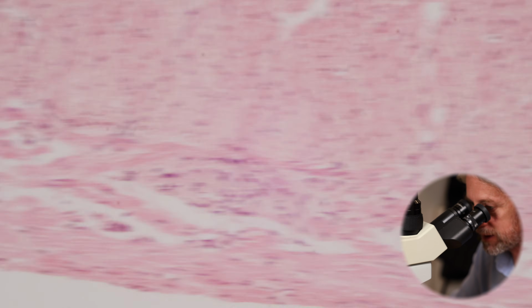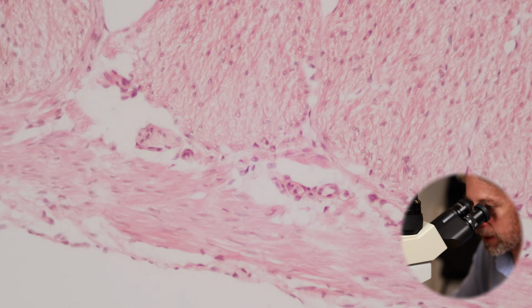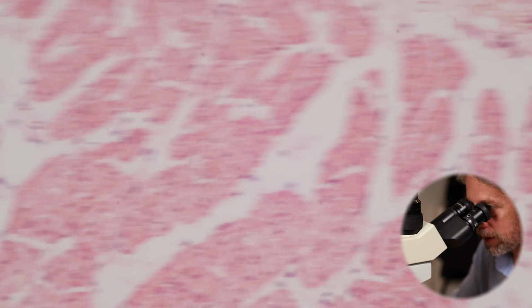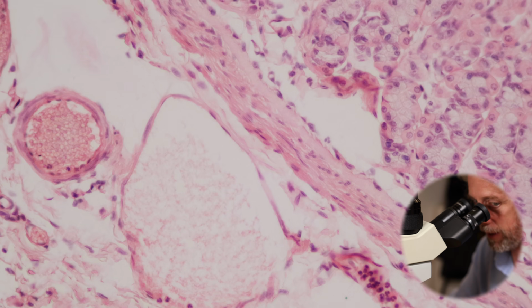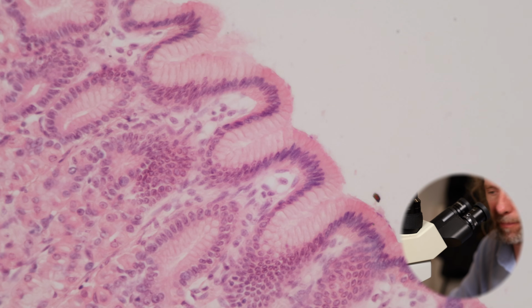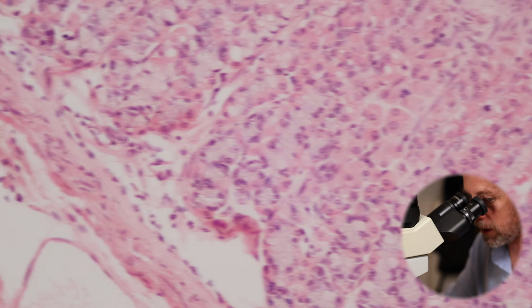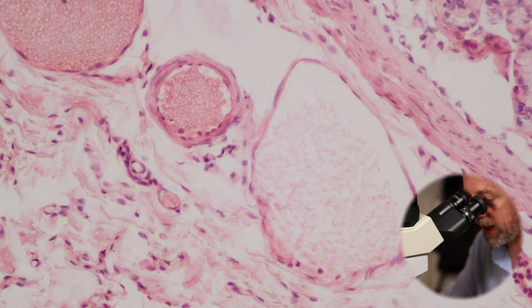Is all of this quite lightly stained? Yeah, it is. But look there. Oh, look at that. So there's the mucosa, the epithelium, and what have you. There's the muscularis mucosa, and look, so now we're in the submucosa.